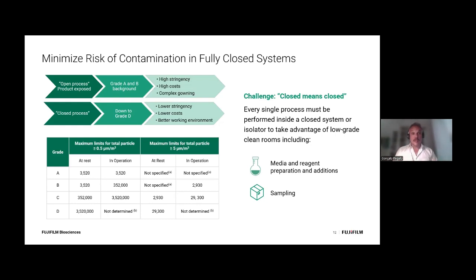Now, if you resort to automated systems and these cells are processed in an aseptic environment, in single-use, disposable systems, it's considered a fully closed system. The requirements for this clean room drop dramatically, which means it sounds cheap and easy to manufacture cells under the laminar flow, pipetting things in and out at first. But when you look ahead and you want to start making these cells at scale, very quickly that transition will need to be made because it's extremely complicated to handle this at scale.